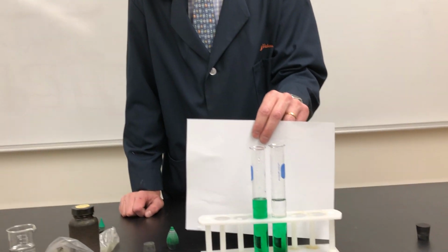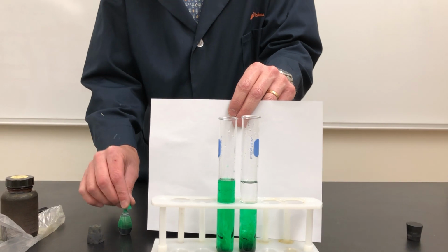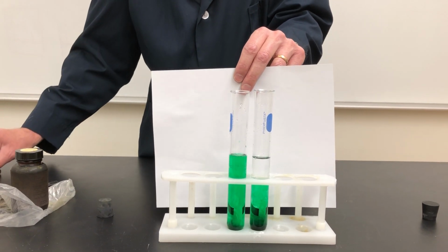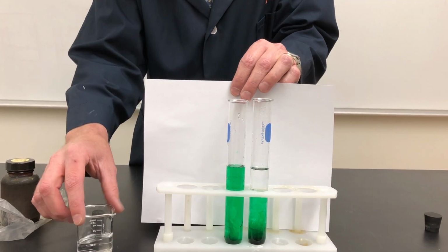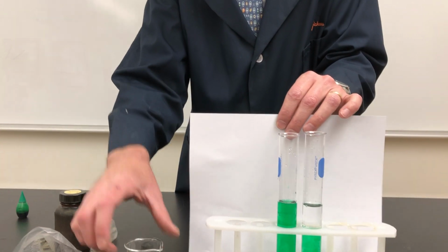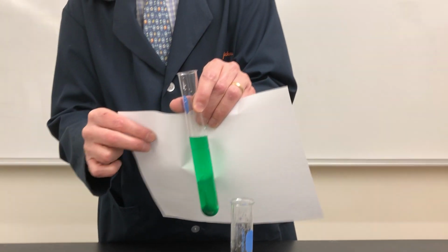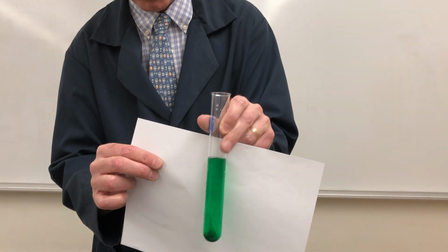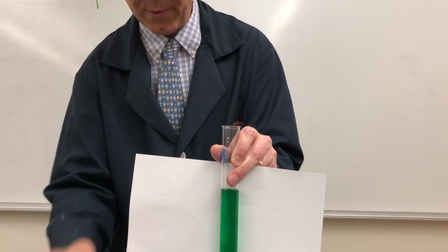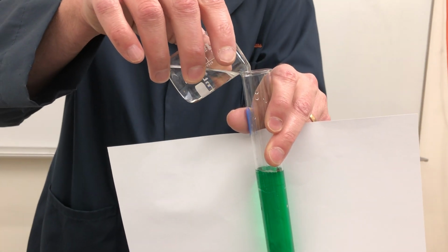to demonstrate that it's not just a difference in density that's keeping those things from mixing, let me show you something that is also less dense than water, but will mix with the water. This is some ethyl alcohol. Ethyl alcohol is less dense than water, and I'm gonna try to pour this in very carefully so that it doesn't thoroughly mix with the water and it sits on the top of the water. So let me pour this.